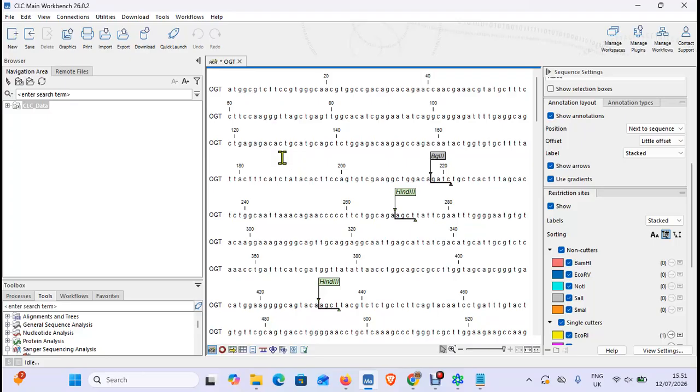This is important. So in this universe, I'm imagining that we have access to a plasmid from somewhere or someone with OGT already in it, in which case I will aim for a melting temperature of the primer, forward and back, of mid-60s. So 66 is ideal. Any more is okay, but you always want to finish on a G or a C. That's the point. So the reason that I would go over that value is if I found myself with TTTAAA, and then I would crawl through the desert to the next C or G, and then call it a day.